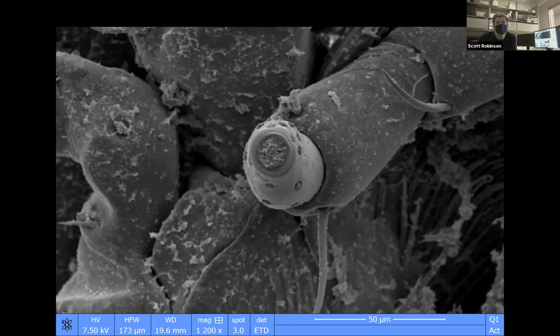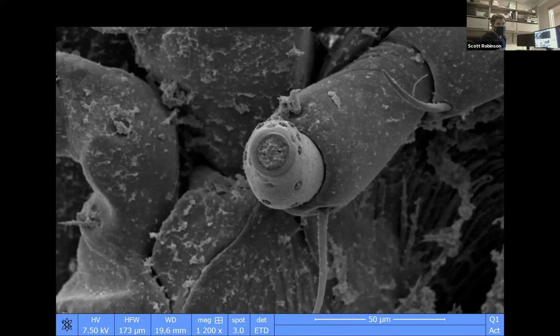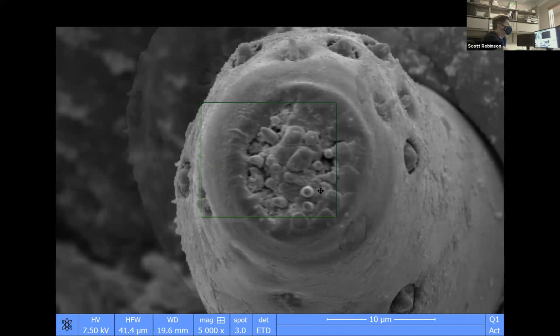And it's a really specialized version of a cathode ray tube, and the cathode would be on the top. Instead of making light go across the front of your TV screen, it has a very, very fine probe, a very fine beam of electrons that's constantly rastering across the sample. Every time we change the mag, for example, you see the lines go by really, really fast. That's a whole bunch of really fine electron beam going past the sample, beaming electrons at the sample.